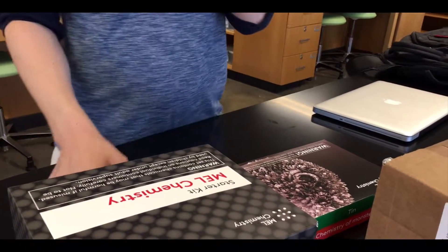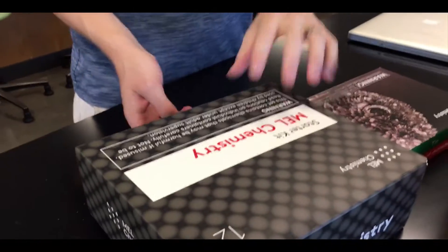Okay, will you tell us what we're doing today? Sure, we are unboxing a Mel chemistry set to see what's inside and doing the experiments. It's gonna be fun. Okay, so let's see where do I begin. I think this is the main kit.